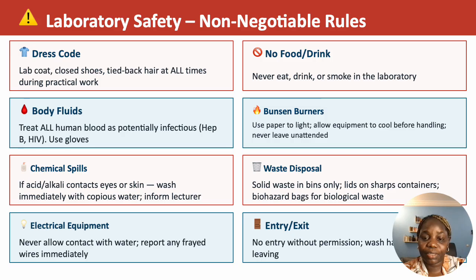And no entry without permission. Wash your hands before you leave and throw away your gloves, not your hands, you need them for later. So throw the gloves in the trash available at the exit of the lab. Okay, just trash them there. Wash your hands with soap and clean water before you go out of the lab.